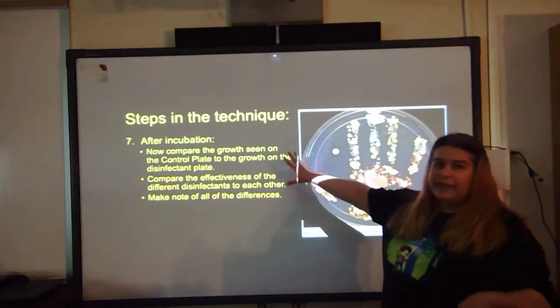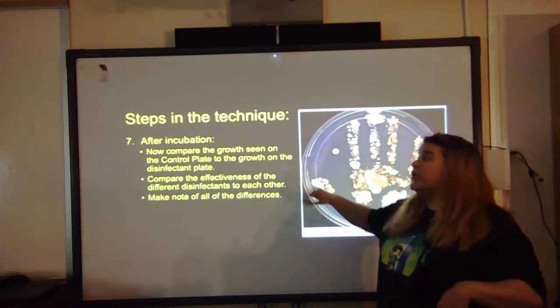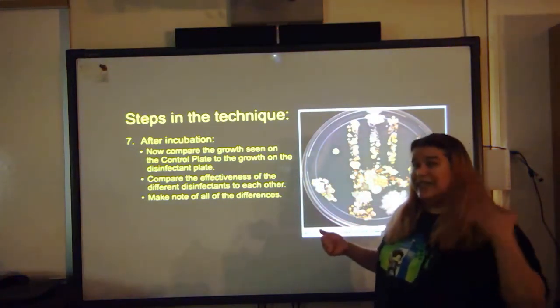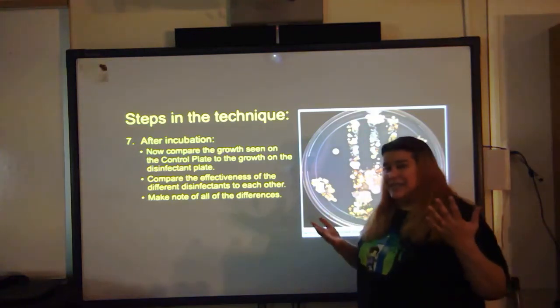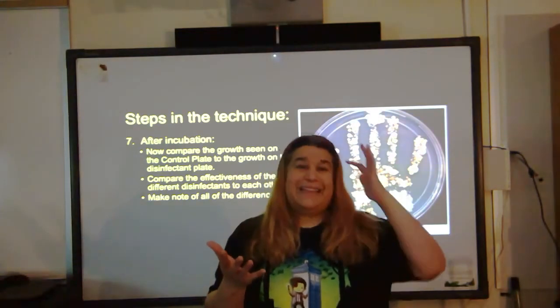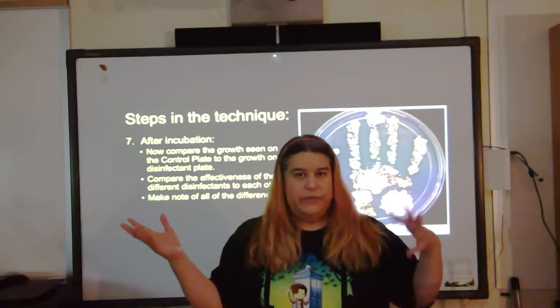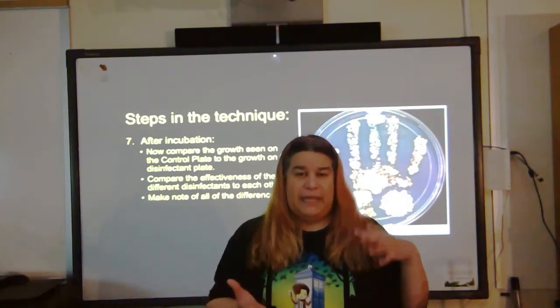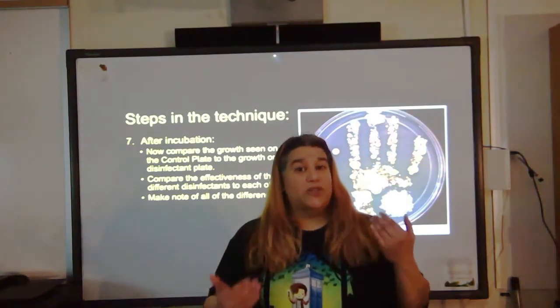We put them in the incubator for 48 hours. After, you're going to compare what you see in the control, where you started, to what you see in the clean hands plate, I'll say, since it's going to be all different disinfectants. But the disinfectant plate, you want to see, did the number of bacteria get smaller?